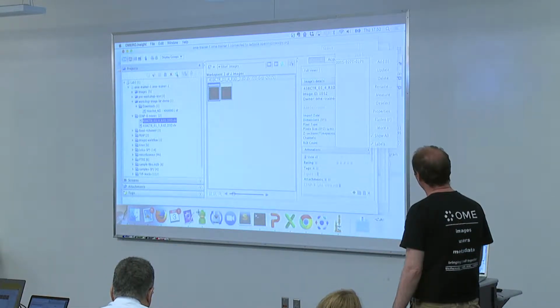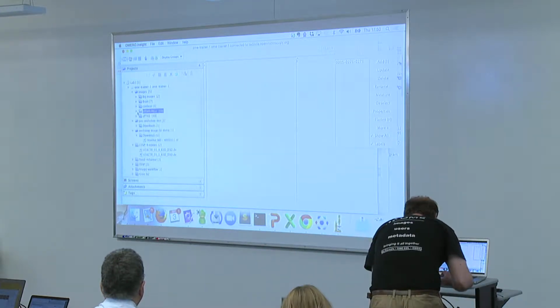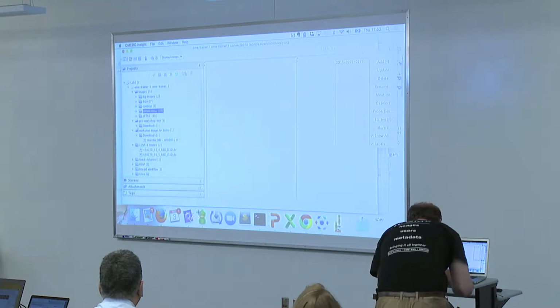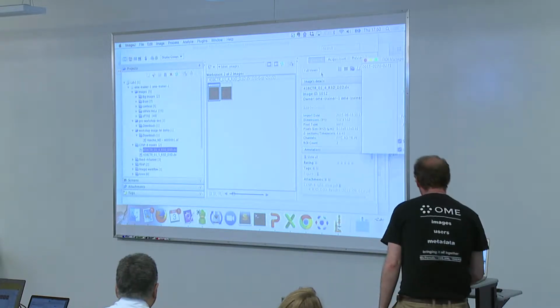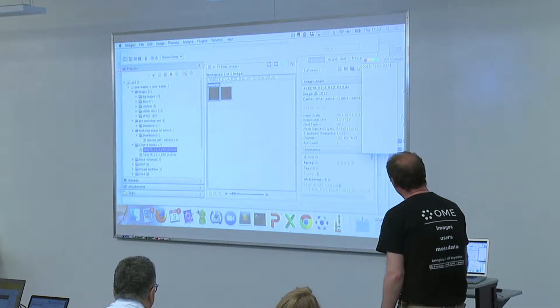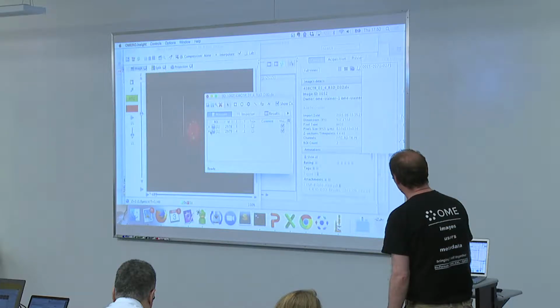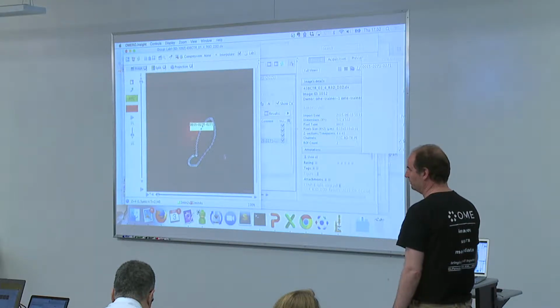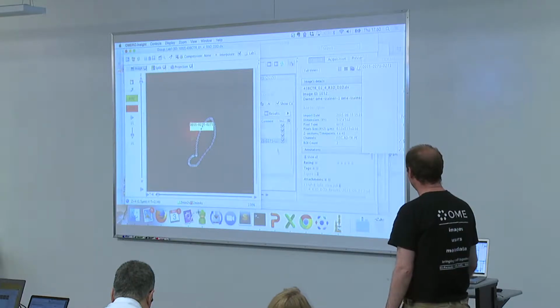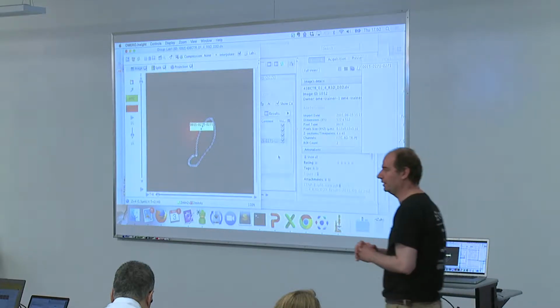So if I now refresh the image here, you can see that I have two regions of interest now. One I drew in OMERO, then I opened an image in ImageJ just to have fun, and then drew another region of interest in ImageJ. And this is now added to the same image. So this is what you saw in ImageJ and is now in OMERO on the very same image, which I just added there. And so on. I can, of course, go with those round trips immediately.